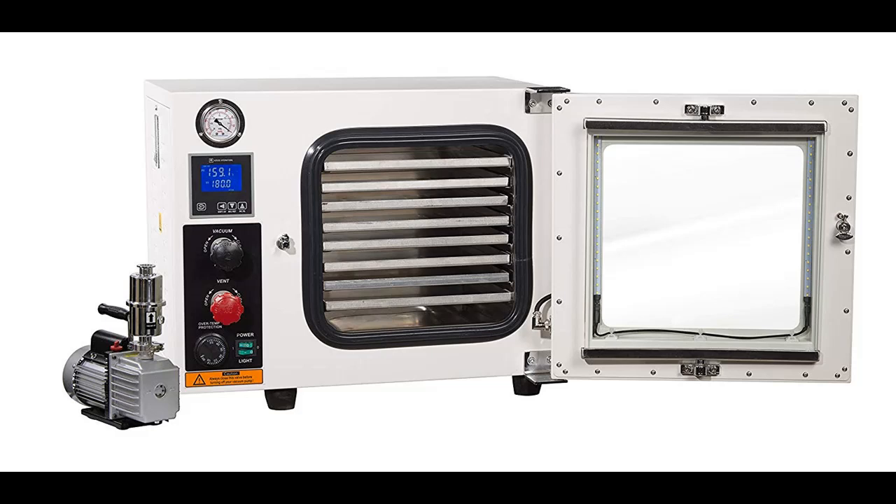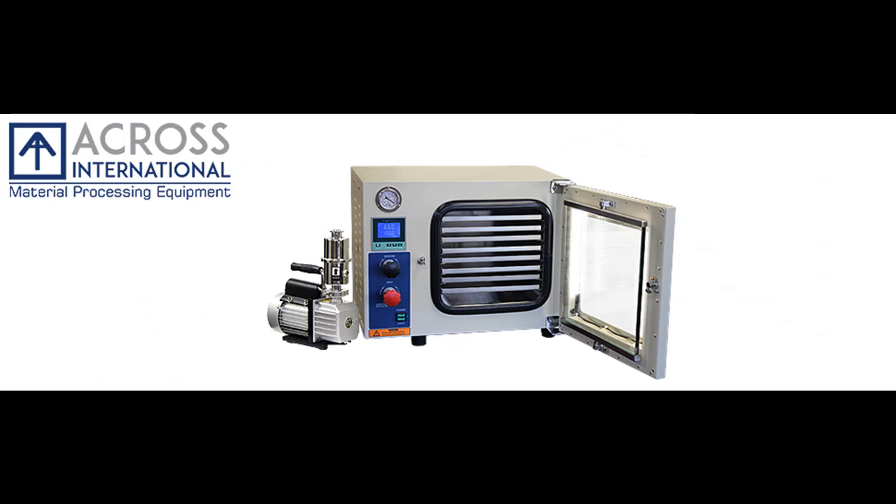The thermal conductive aluminum pan shelves provide excellent temperature uniformity inside the chamber. Our 3rd Gen LCD Low Proportional Gain Temperature Controllers keep your chamber within plus or minus 1 degree Fahrenheit accuracy, in either degree F or degree C.